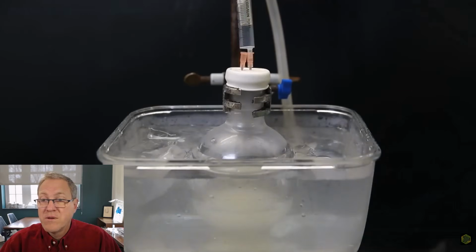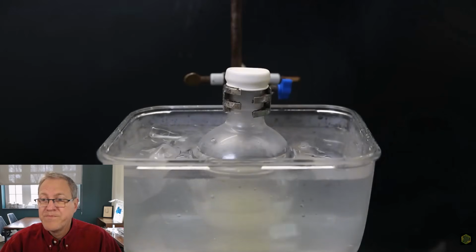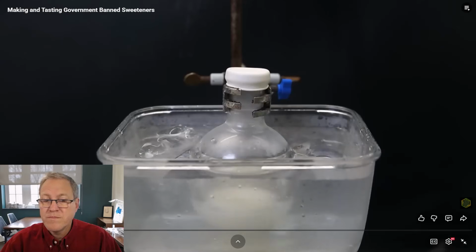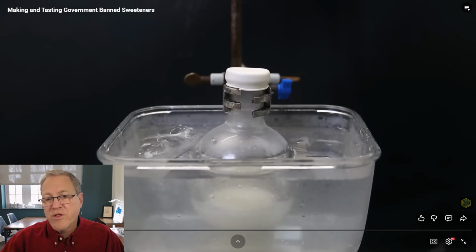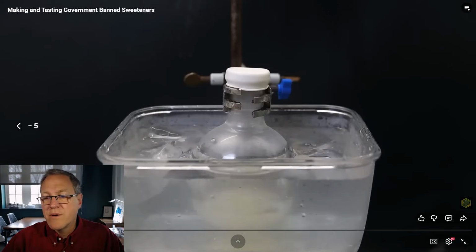But it has all been added. I remove all of the needles and let it stir for a few minutes in the ice bath. Gradually, a white precipitate of the product forms. So let's go back 5 seconds and look at the flask at the bottom.